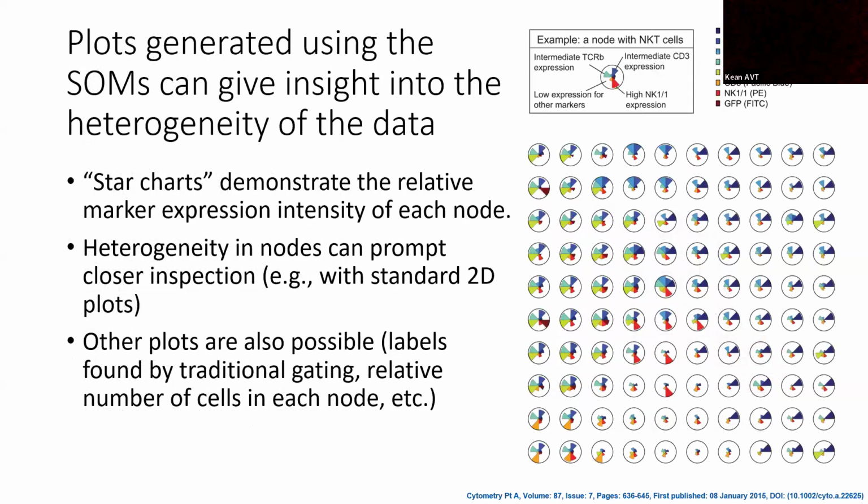These can be plotted using star plots, which basically gives us a visual way to look at what these individual nodes or clusters are composed of, whereas the different parts of the pie that are larger demonstrate more expression of a given marker.